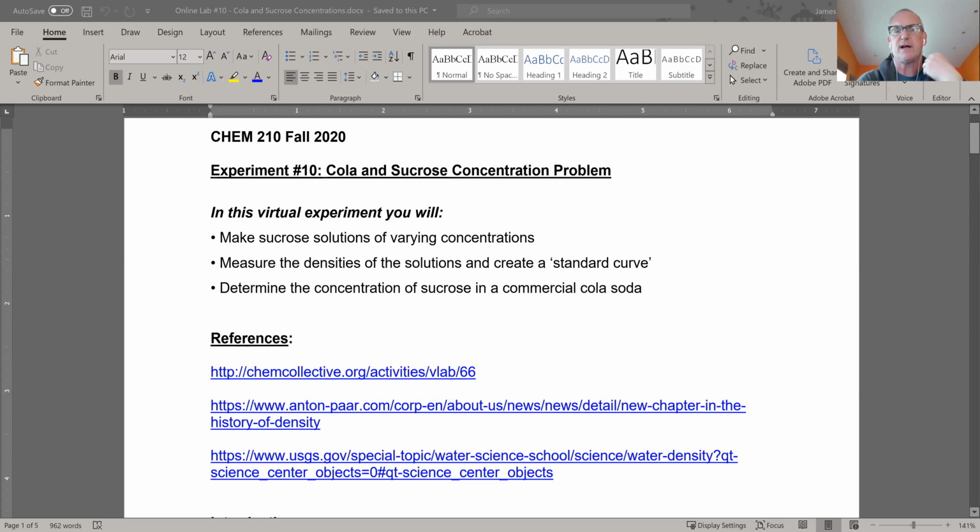So what would you actually put on a standard curve? What are you plotting on it, just in general? Measurements. Mm-hmm. Measurements of what? That's exactly right, you're plotting measurements of something. But measurements of what? Yeah, concentration. Okay, that'd be one thing. But if you're going to plot something, what do you need to know? If you're going to plot a measurement of something, y would be the dependent variable with the measurement.